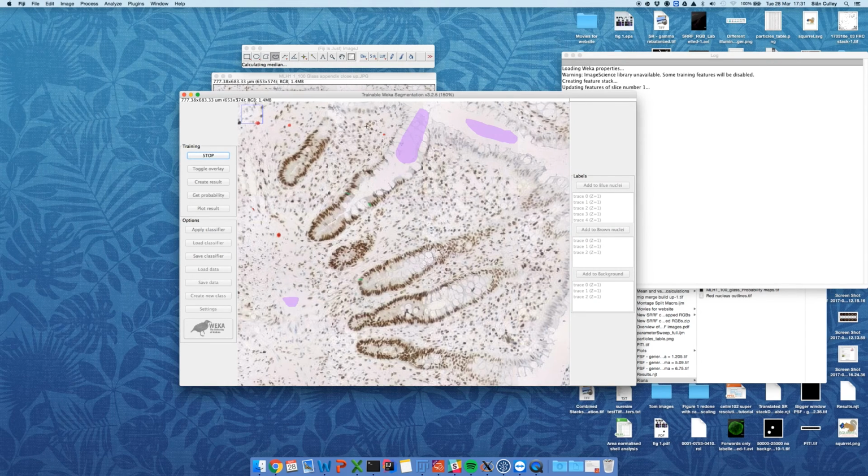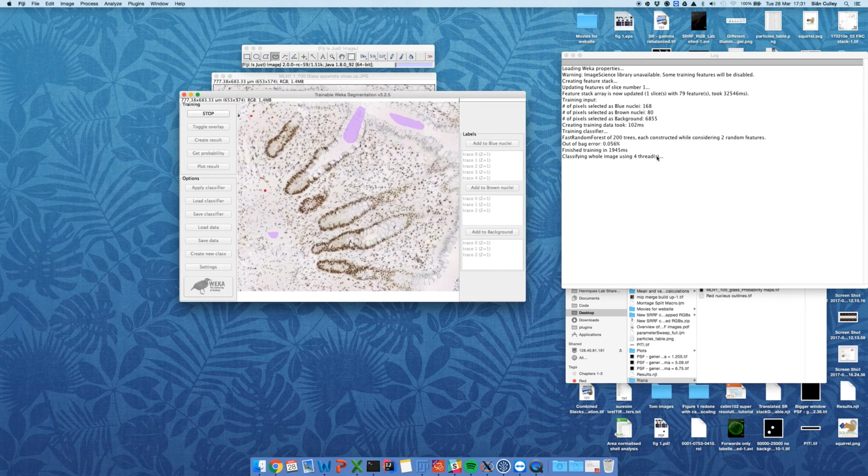So this is going to be the awkward bit of the video where I ramble aimlessly while it's classifying. Again, we've got more information about what we've had as input, and here we can see our image that we've trained up.